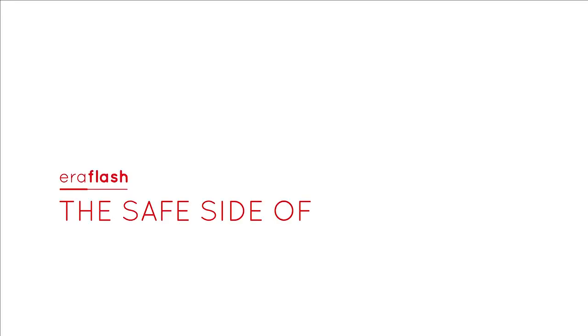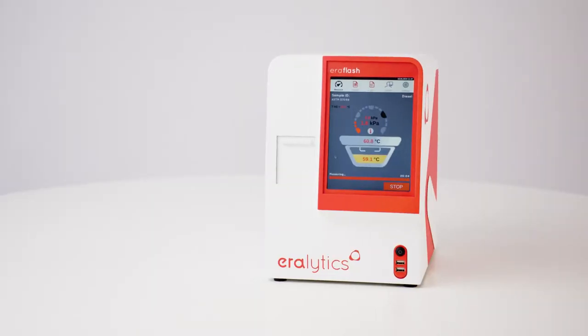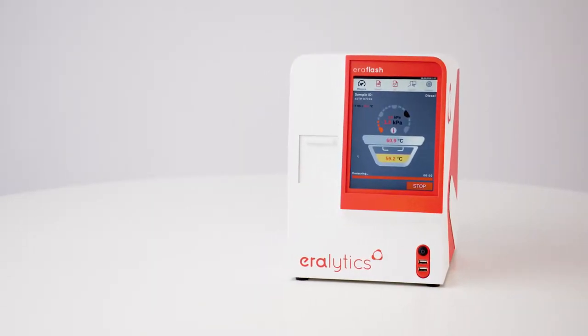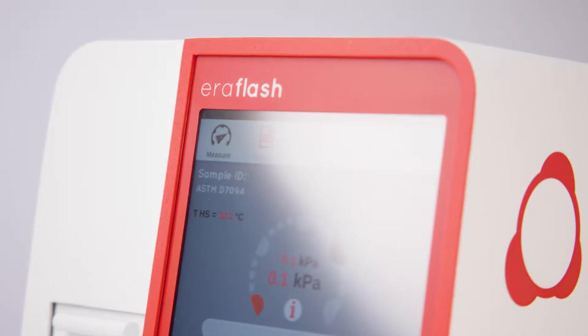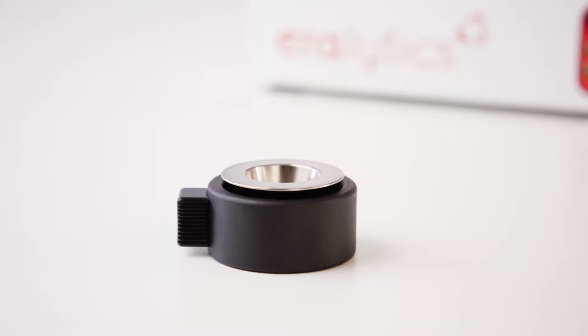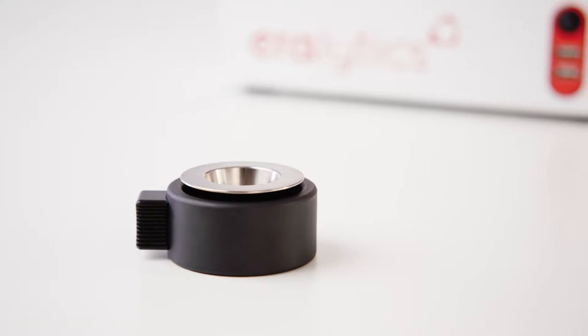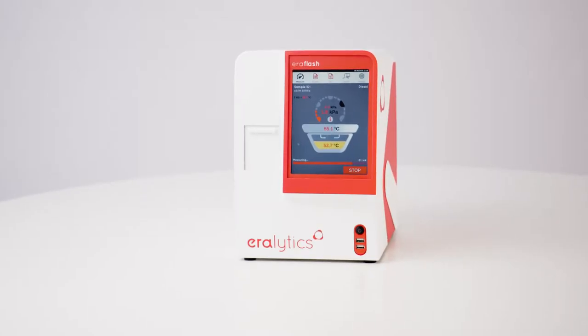ERAFLASH — the safe side of flash point testing. The Flashpoint tester ERAFLASH fully complies with the inherently safe, continuously closed cup methods for maximum safety and speed. The small sample size makes ERAFLASH the ideal solution for all kinds of applications, covering the widest temperature range on the market.